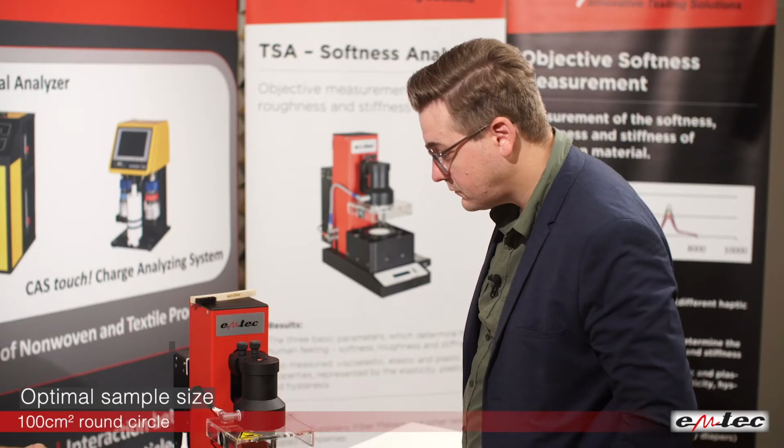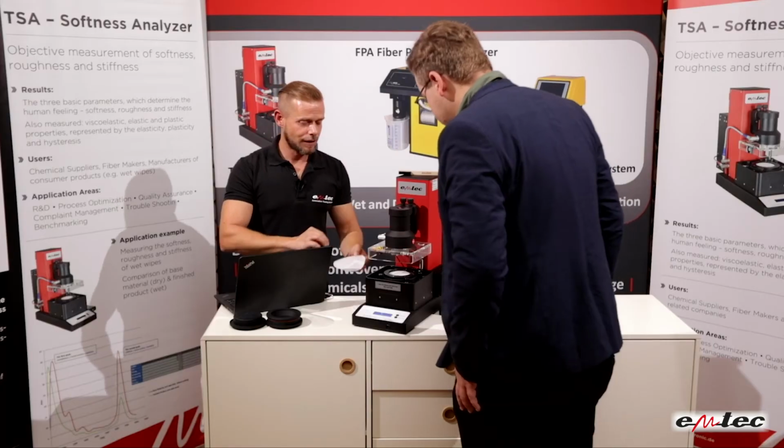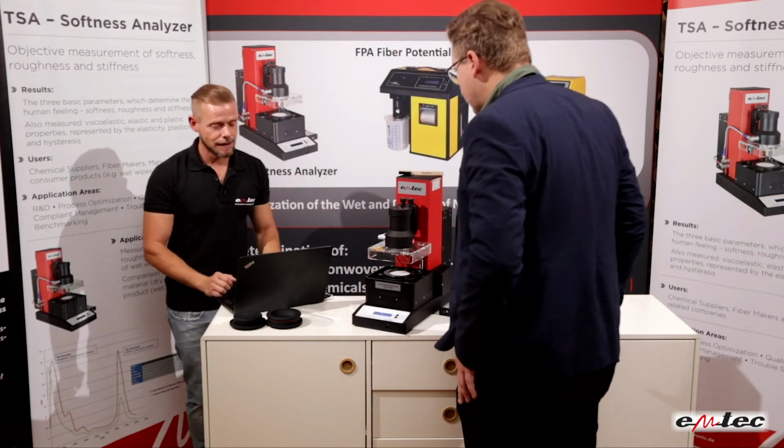It can be a bit smaller. It can also be a square. It's just that this is optimal. If it's this way, it's the easiest way to fix the material in the device.